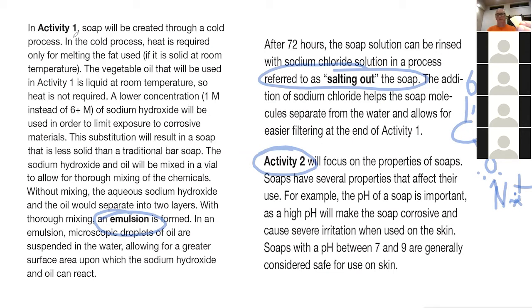So you have these pH strips. What you're going to do is take a little bit of your solution and spot it on the pH paper, and then it will change color, just like the pH indicator we used earlier. Then check the color.